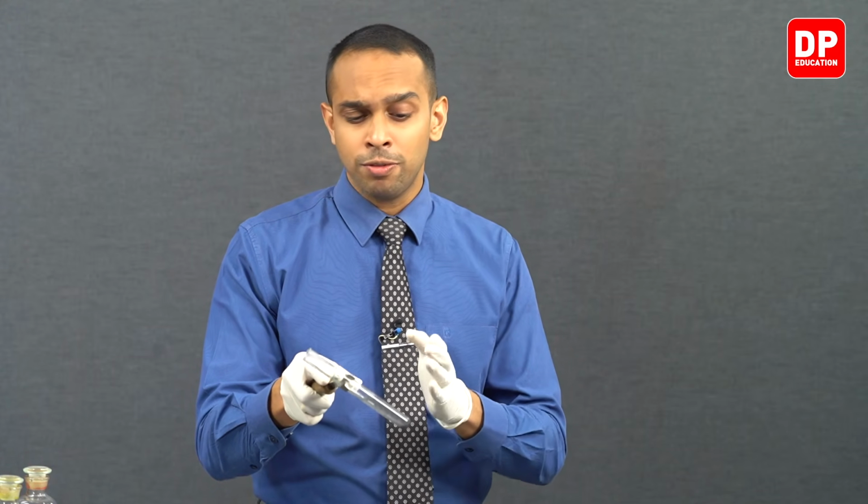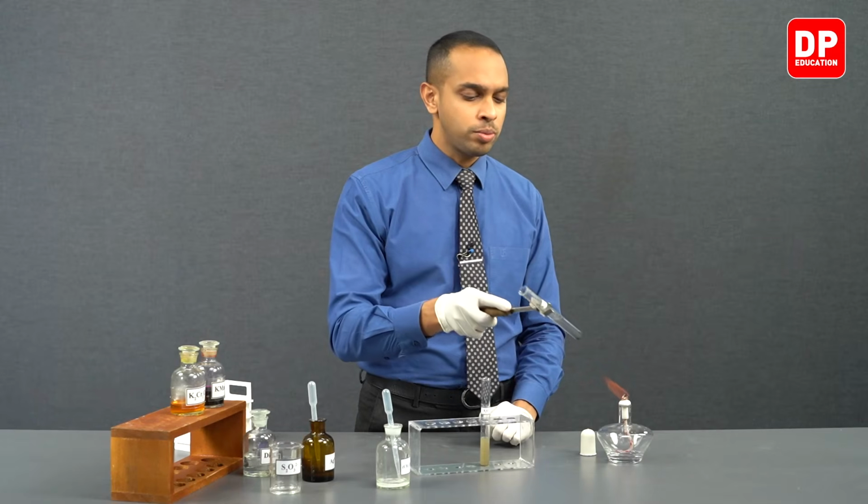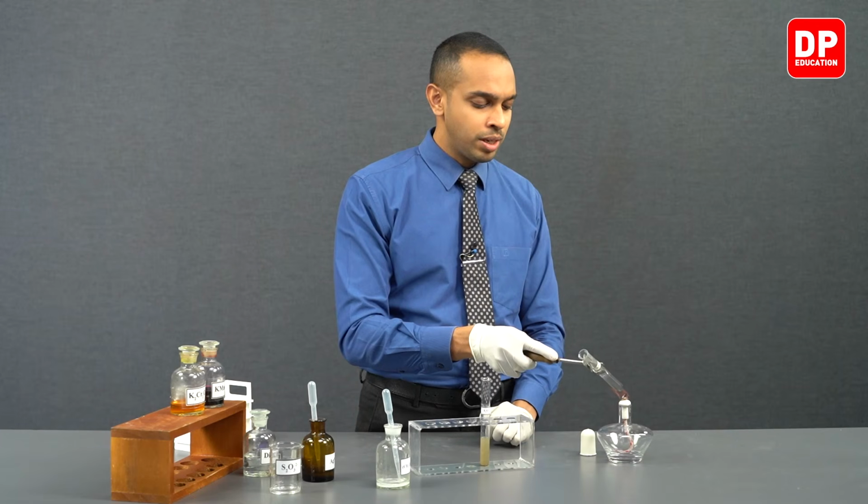So as we added lead ions and thiosulfate ions together, we formed lead thiosulfate, and when we heated our white color lead thiosulfate precipitate, we formed this black color lead sulfide precipitate. So what we have formed here is our black color lead sulfide precipitate. If you want to observe the color very clearly, I can bring it to the heat again.